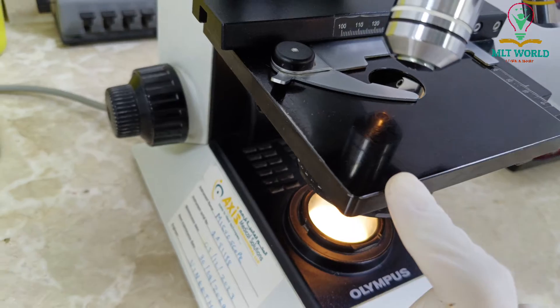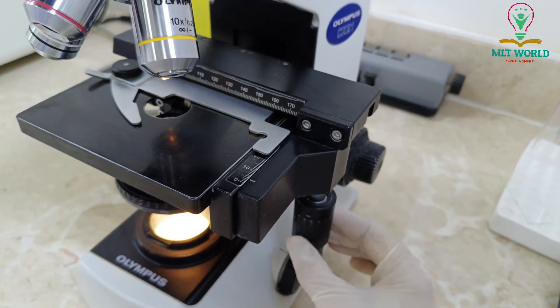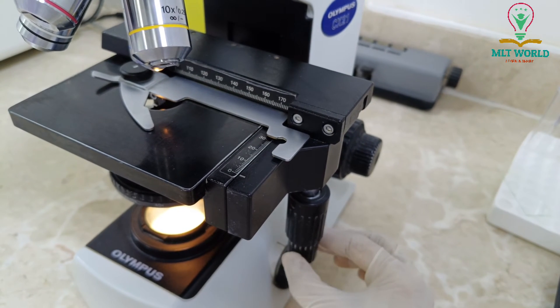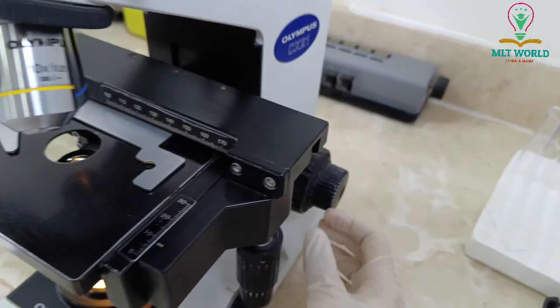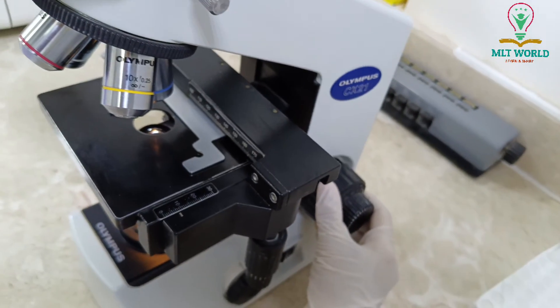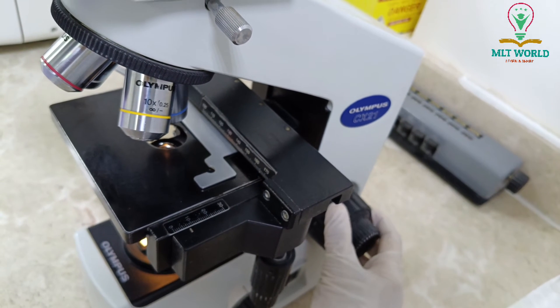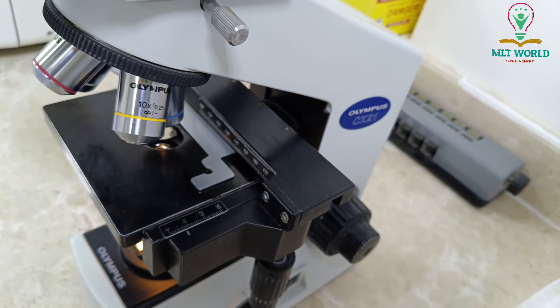This is the eyepiece, this is the head of the eyepiece, and this is the head of the microscope. These are the objective lenses, this is the stage, and this is the stage control for movement — we control the stage left and right with this. This is the coarse adjustment, which we use to move the stage up and down to focus.